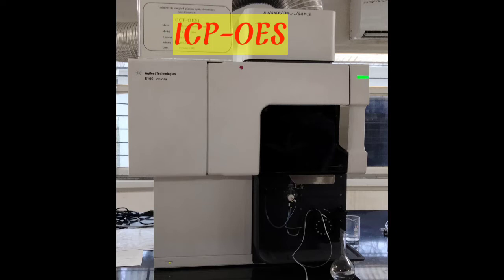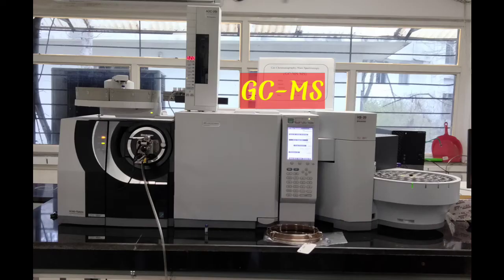The principle uses the fact that atoms and ions can absorb energy to move electrons from the ground state to the excited state. The source of the ICP-OES is argon plasma. The ICP-OES is used to determine how much of certain elements are in the sample. The next instrument is GCMS.